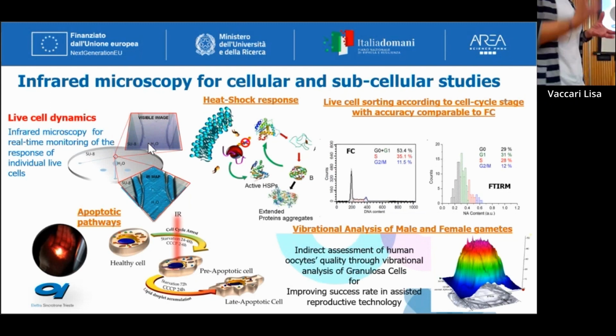In the context of PRP CERIC, which is the real challenge. So if I want to work with the infected cells and try to understand which is the phenotype, for example, you have an unknown virus at the beginning and you want to understand which is the effect of this virus on cell lines. First thing, I have to take them in a synchrotron. So the first thing is safety.